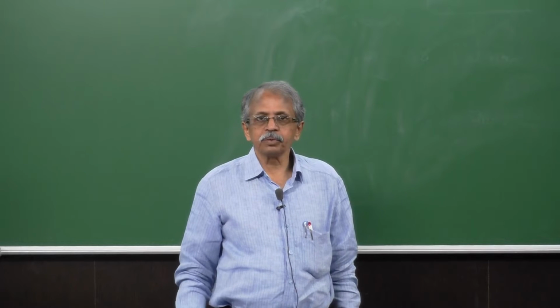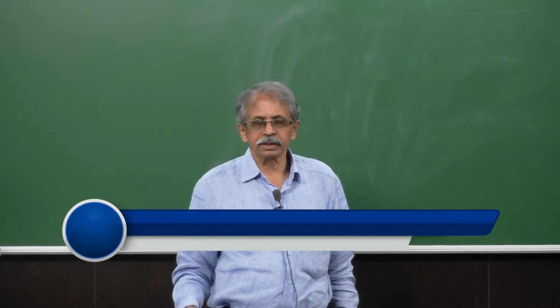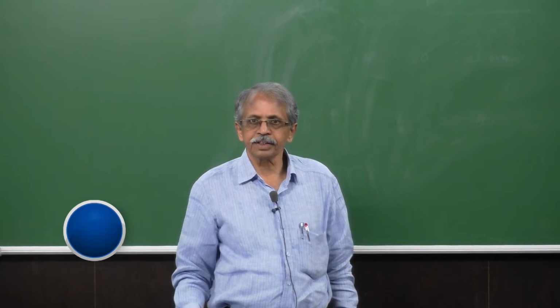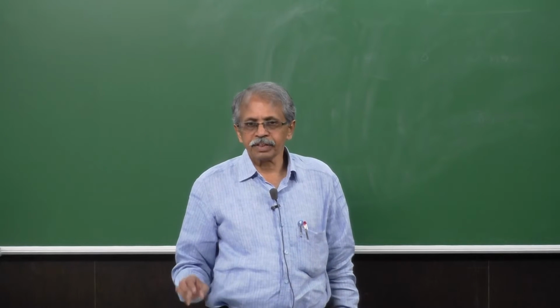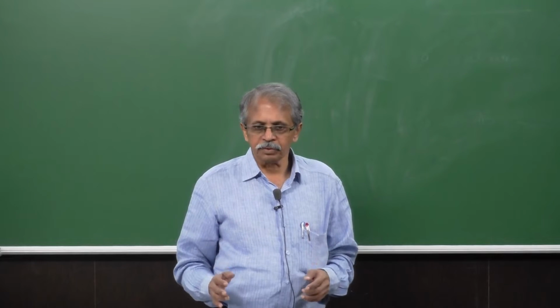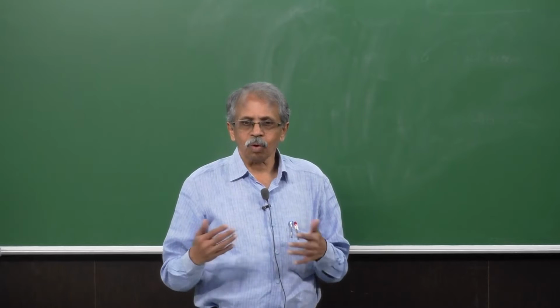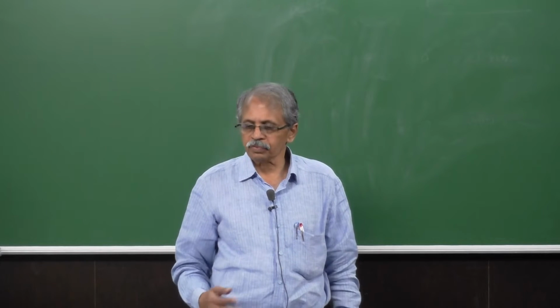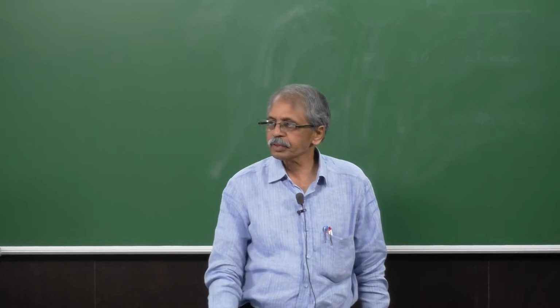Good morning, welcome you all to this next class on the spectrophotometric titrations, which I initiated in the previous class itself. It's a very important component because almost all the parameters that you derive from the transition metal coordination chemistry complexes go through a huge amount of spectrophotometric titrations.